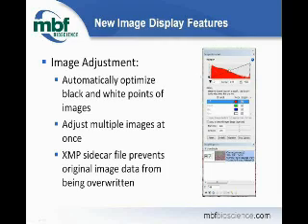So if you're making adjustments to the red channel and you have this box checked, it will adjust the red channel equivalently all the way through each selected image.